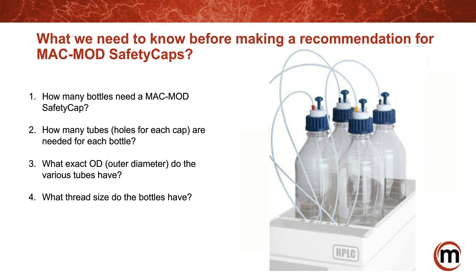So before coming up with a recommendation for MacMod safety caps, we generally need to gather some information from the analyst first. So these are things you might want to think about. 1, how many bottles need a MacMod safety cap? How many tubes are needed for each bottle? What exact outer diameter do the tubes have?